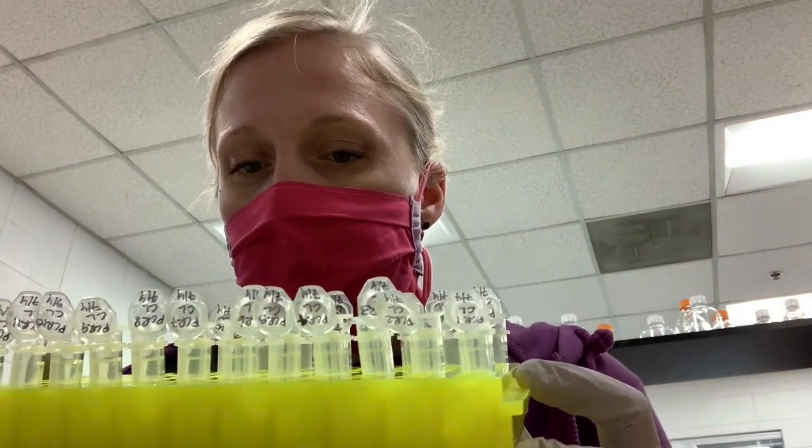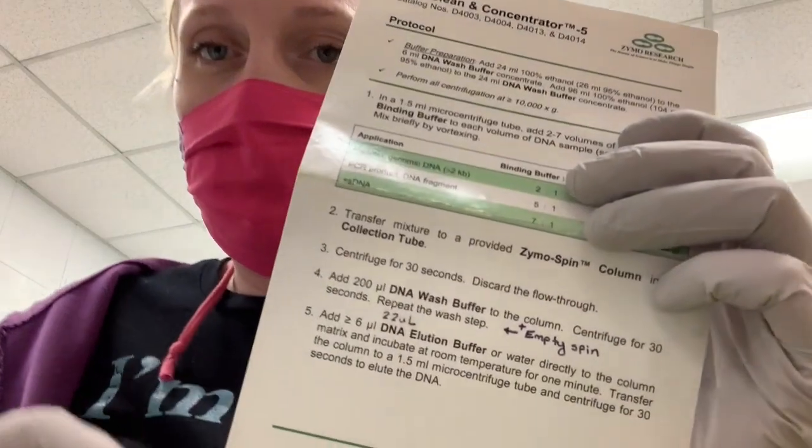So for example, I'm going to use this purified DNA to make double-stranded RNA, and the EDTA and other molecules that are in this elution buffer can interfere with some of the enzymes we need to use our DNA with. So I do a little bit of an extra step before I do elution. I let my tube sit for about a minute, so we're almost to a minute. In the meanwhile, I'm going to prepare to elute. So I'm going to use water instead of elution buffer.